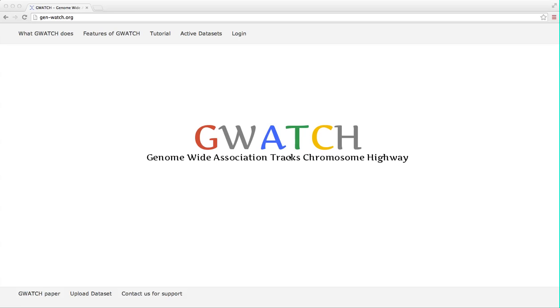Welcome to the GWATCH tutorial. I will show you how to use GWATCH, an online dynamic real-time genome browser designed to discover, view and assess gene association hits from genome-wide association studies and also from whole genome sequencing datasets.